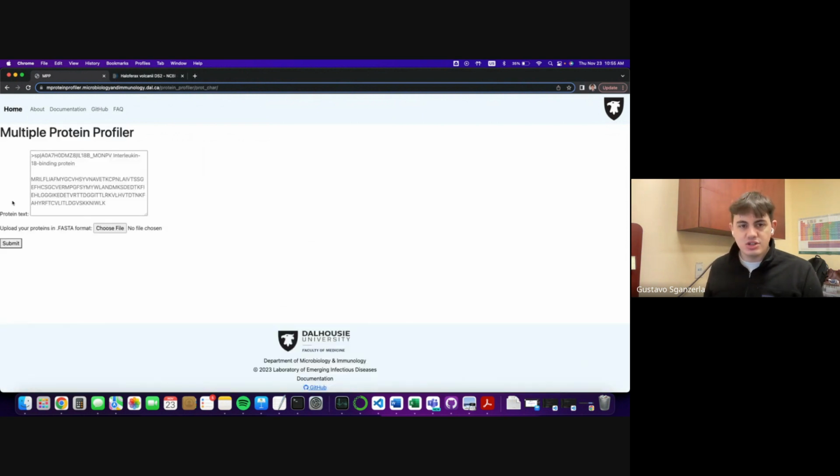And that's it. This is a short tutorial on how to use the tool Multiple Protein Profiler, and how to obtain the entire proteome of any organism of your interest and use that to profile the proteins.